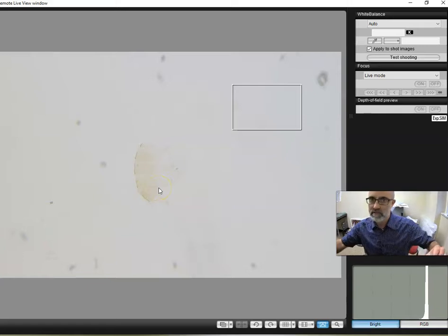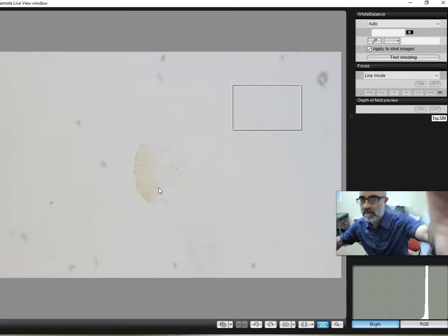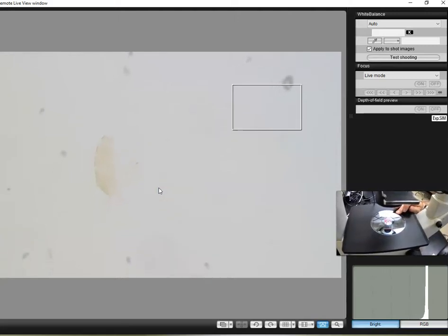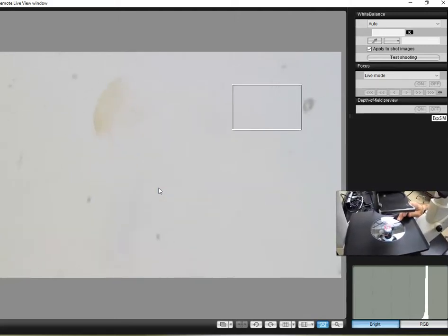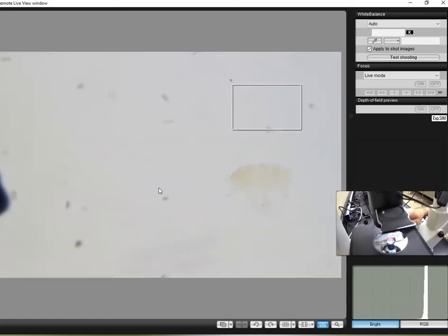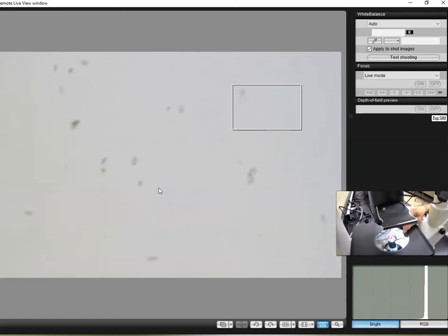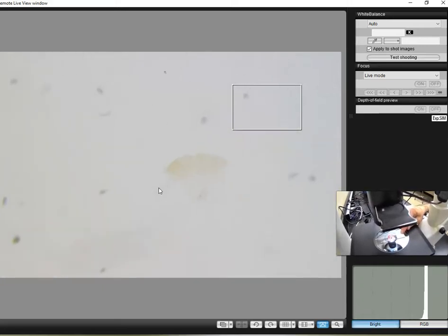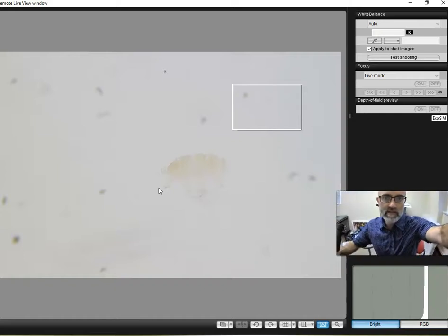So what I'm going to do is actually spin the glass. Alright, so I can take this and I can spin this whole thing. Alright, watching what I do to make sure I don't lose my little friend. Here, keep spinning this around. Oh yeah, that's good. Okay, and then it's not perfect. Oh, I lost him. There we go. That looks good. I like that a lot.